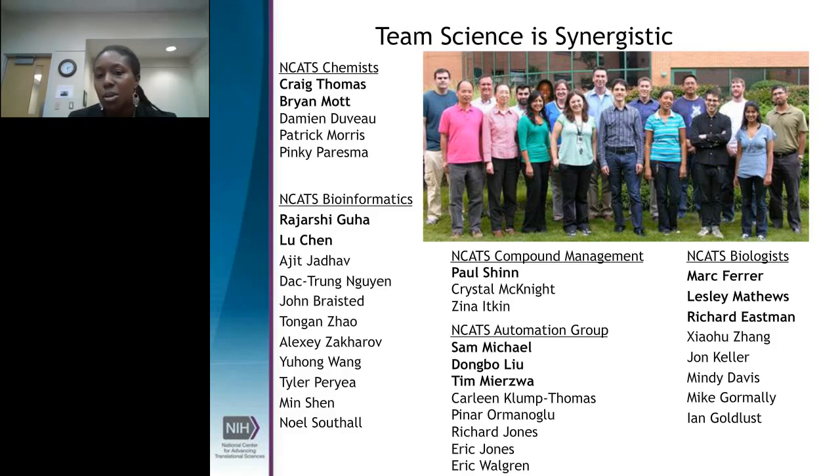And so we've come up with a workaround for that, and that is that we just try to plan ahead for situations where we need to have the same plate in the same location being used on both EDCs. We just try to schedule things to where they will not overlap.